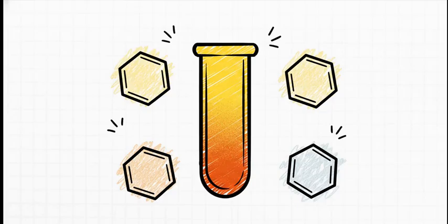So let's bring it all together. The Xanthoproteic Test is an incredibly simple, highly effective method used to detect aromatic amino acids and proteins. The whole shebang really comes down to this one undeniable, completely clear yellow to orange color shift. It's a beautifully straightforward diagnostic tool. It literally takes the invisible microscopic world and makes it vibrant, colorful, and completely understandable for us.